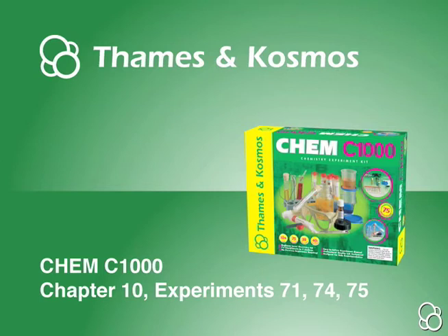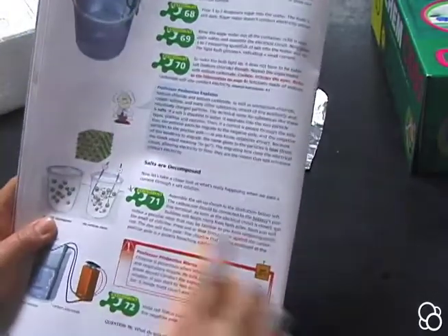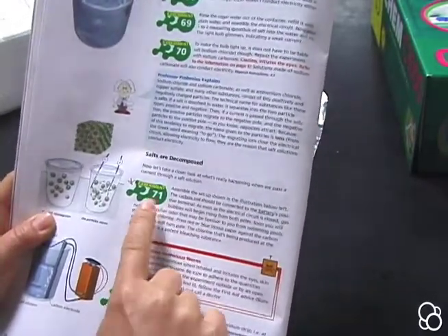Now we're in Chapter 10, Electricity and the Chemist, and we're going to start with Experiment 71, Salts are Decomposed.